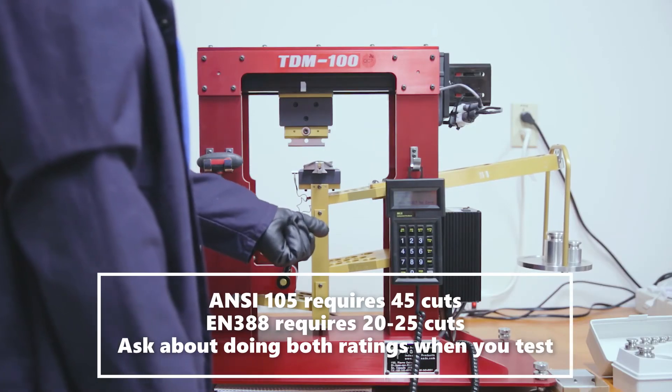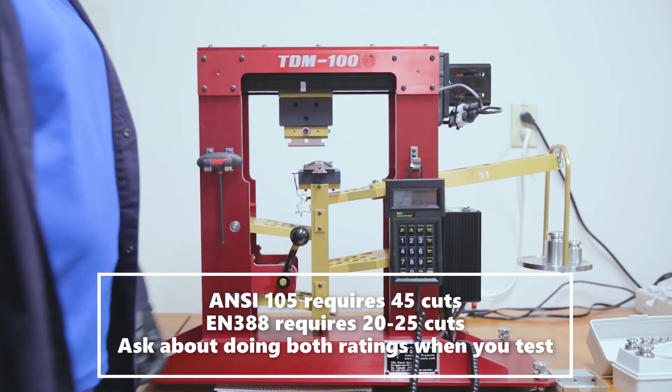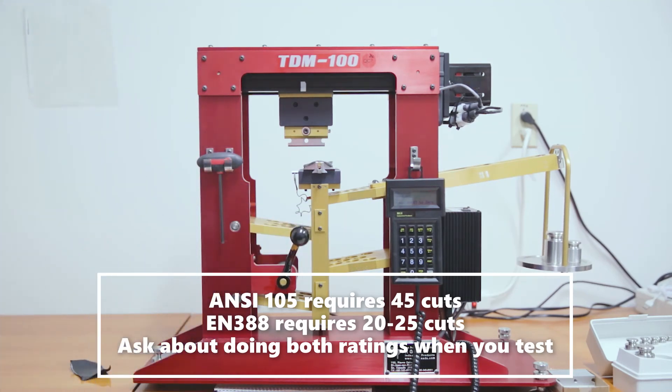Once the correct number of cuts has been completed — 45 for ANSI ISEA 105 and 20 to 25 for EN 388 — the gram force rating is compared to the classification system of its respective standard and labeled appropriately therein.